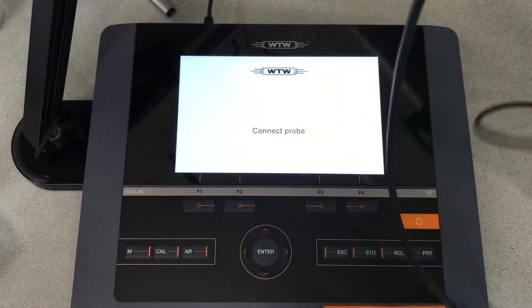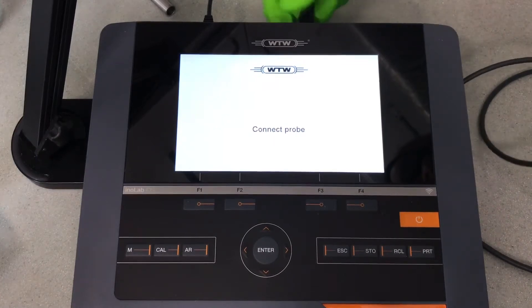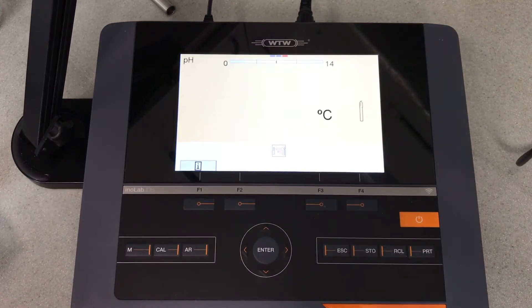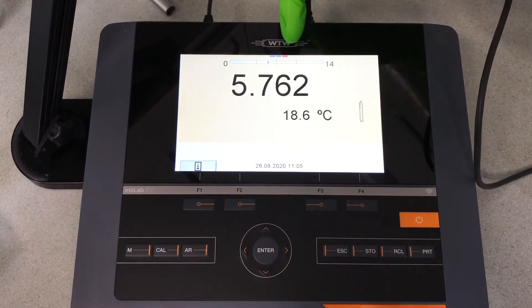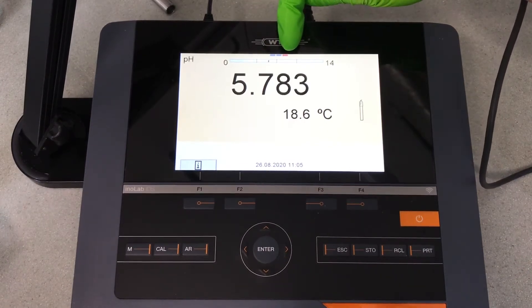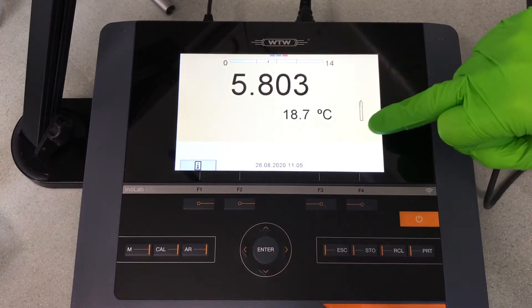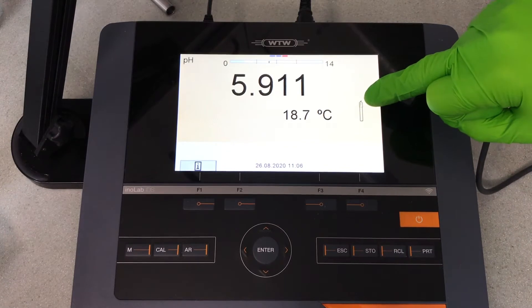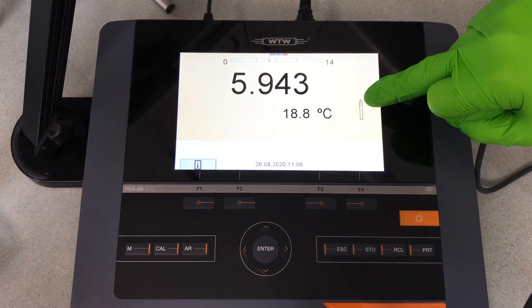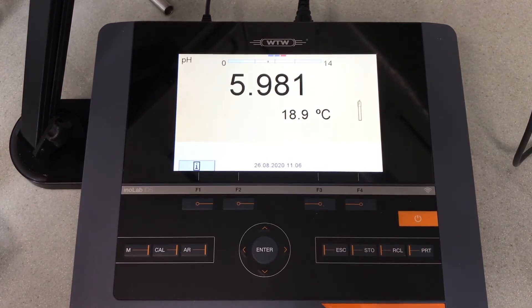What I have here is a pH electrode with cable. So I'm going to plug that in as instructed into the back of the meter. The meter now sees the electrode and takes a moment for the reading to come up. You'll notice there are three little icons at the top. The right-hand icon in red is indicating that the probe has been plugged into the far right-hand connector. The indicator on the right-hand side is the health of the electrode. This particular icon shows that this electrode is now in need of replacement — there should be three bars indicating the probe is in good condition, and the bars go down one by one until you have no bars left, indicating this probe should be replaced and is borderline in terms of calibration.